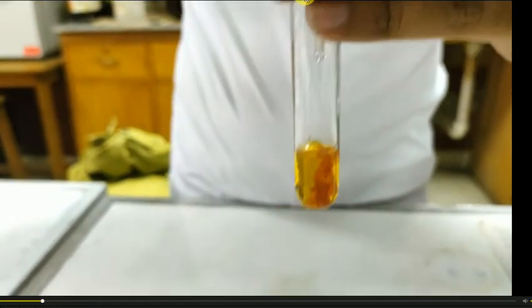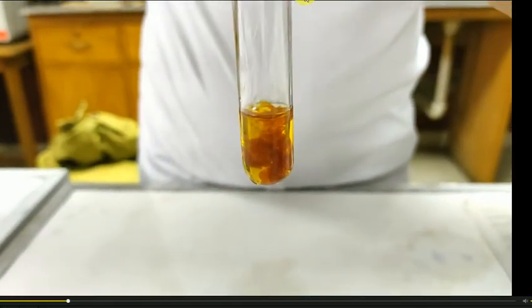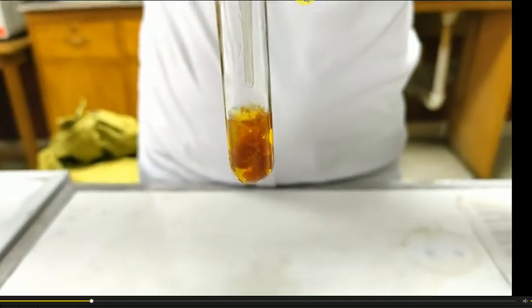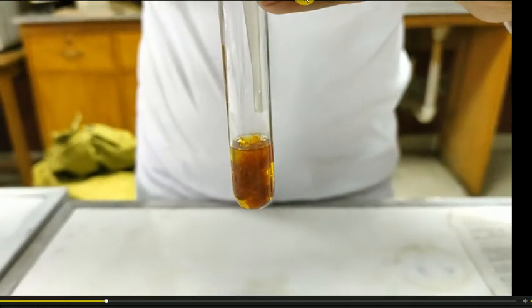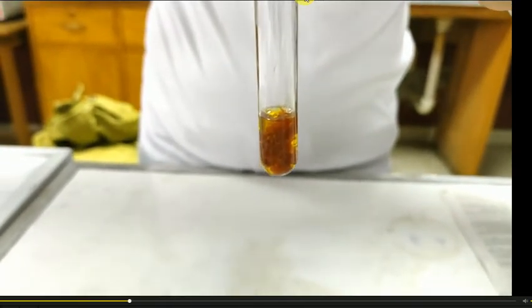Increased addition of alkali will not dissolve the precipitate, and we can see that it is prominent that the PPT is insoluble in excess alkali. As the amount of alkali increases, the PPT also increases. So this is a light gelatinous PPT, and this is indicative of the presence of ferric ion.